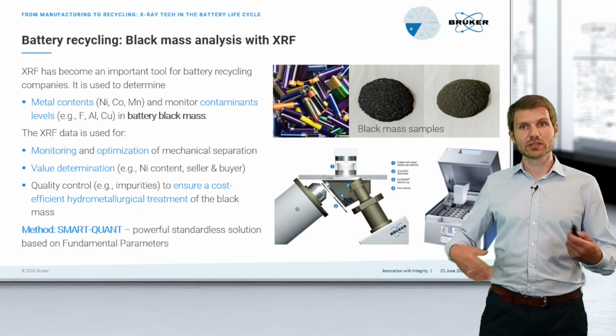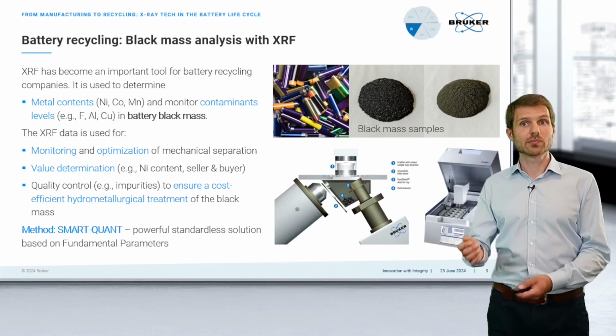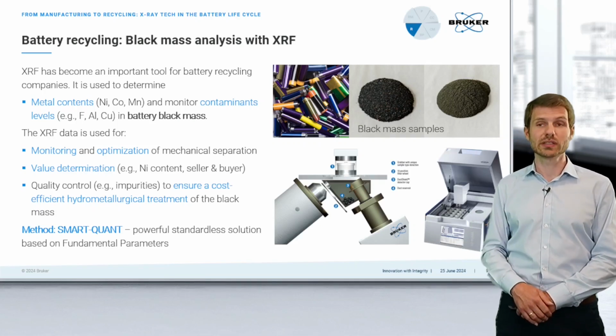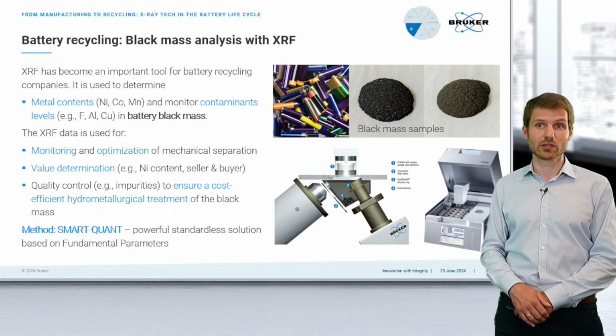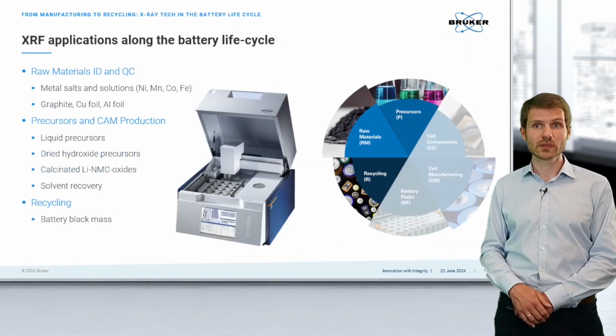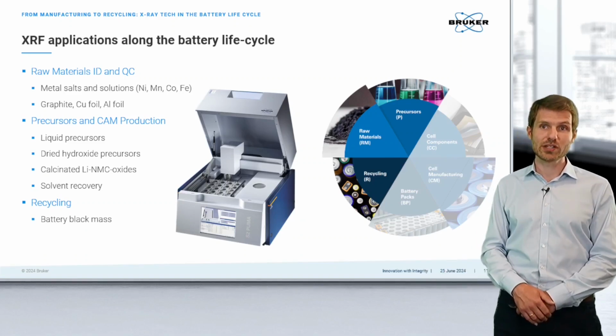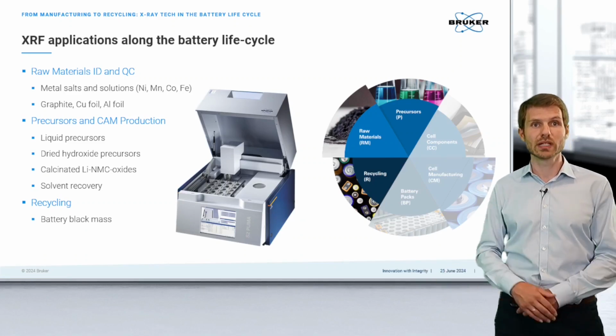Oftentimes in a recycling process you would calibrate. In some cases when you don't know what you're receiving, for example on receiving goods, you can use our standardless method which is called SmartQuant. So overall here, a very brief summary of the applications of XRF along the battery life cycle.